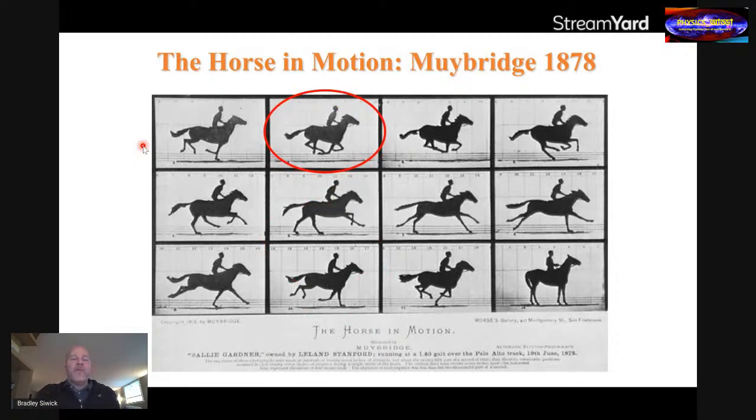Okay, and in this particular case, instantaneous flash photography was able to answer the question, right? If you can actually watch the horse gallop and you're able to take photographic images that have a sufficient time resolution, so that you can actually resolve the motion of the horse's legs, you can see that there is this moment in time, during a horse's gallop where all four hooves are off of the ground at the same time. And so there's a direct analogy between this effectively instantaneous optical imaging modality and the kinds of experiments I was talking to you about with electrons and atomic resolution.